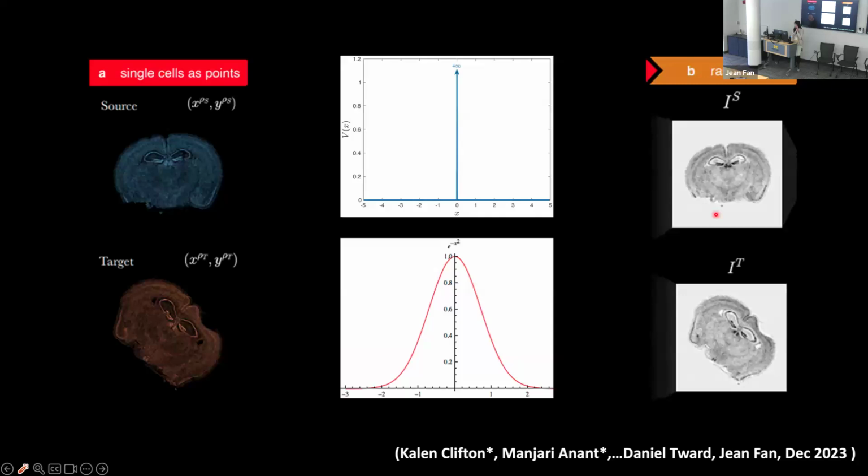So far I think we've been very successful at aligning if it's more than 2 cells wide. If it's a really thin structure that's 1 cell wide, that is very challenging for us.